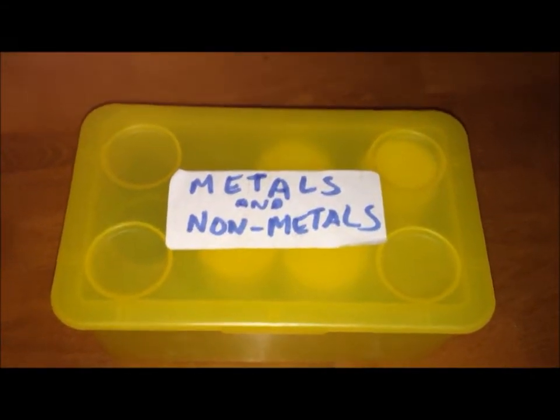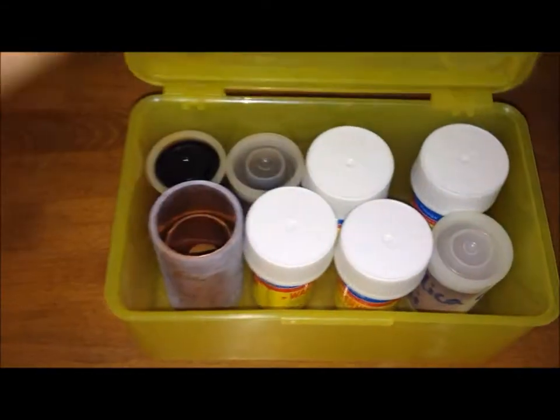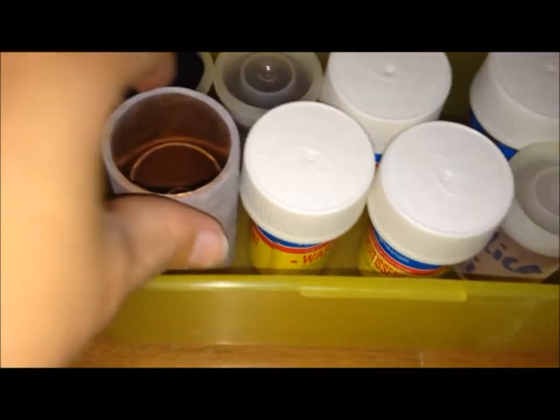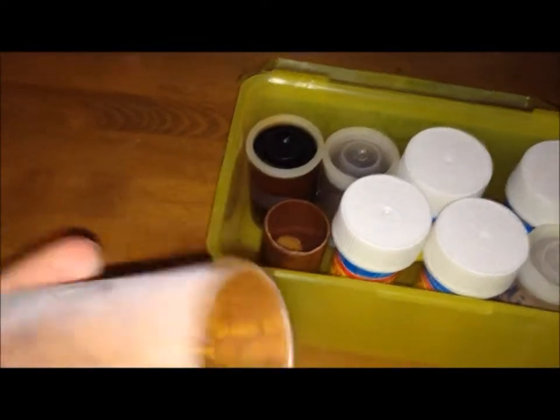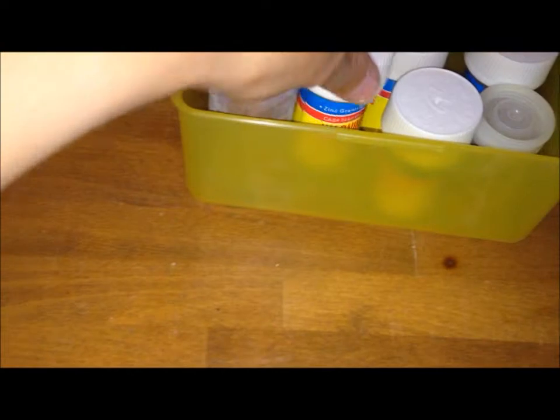First I'm going to show you my metals and non-metals. In here we have some copper — it's pretty pure, just a bit dusty at the moment. We have some zinc, zinc pellets if you like.